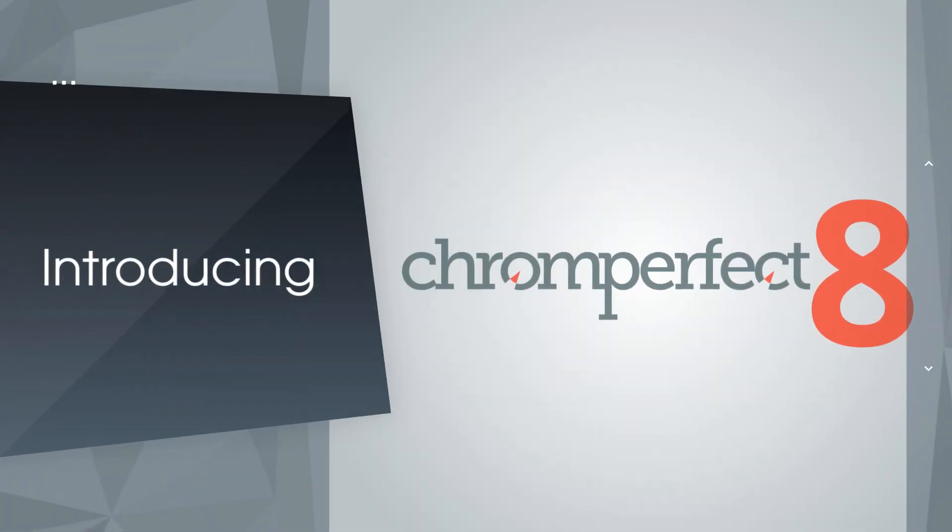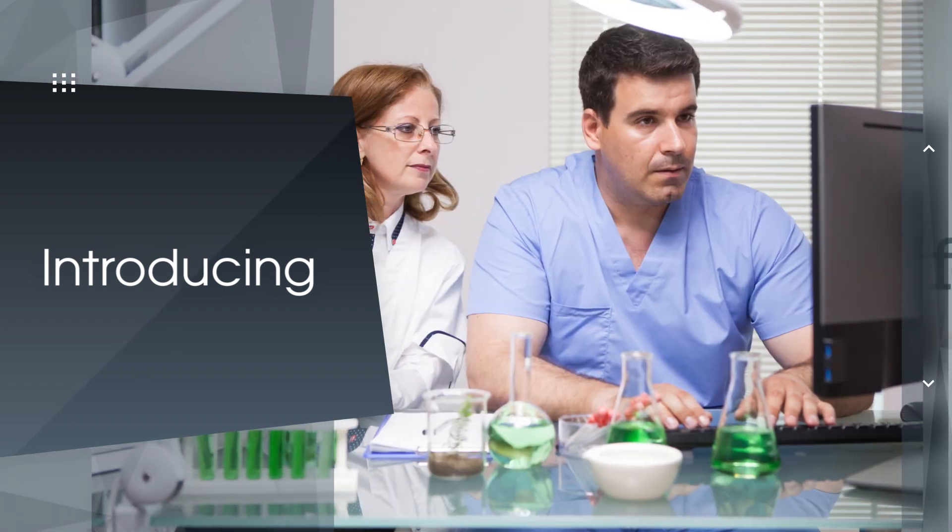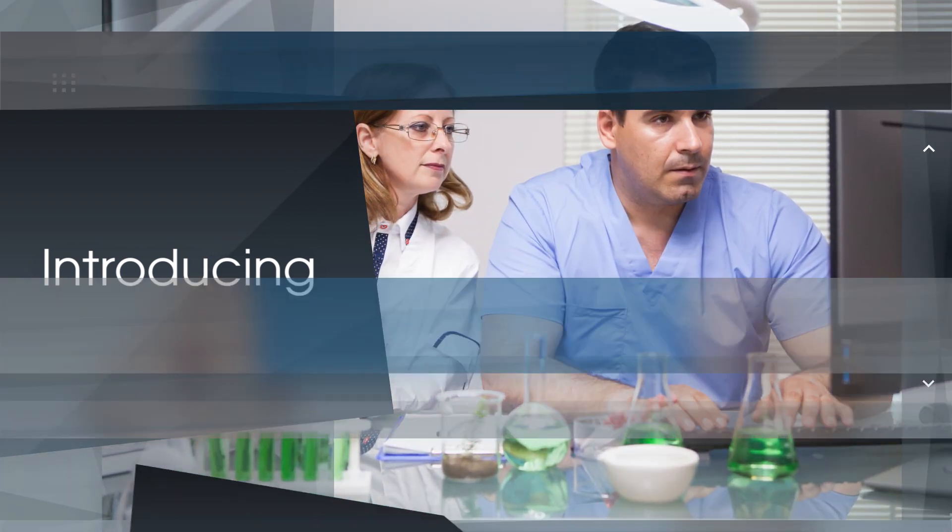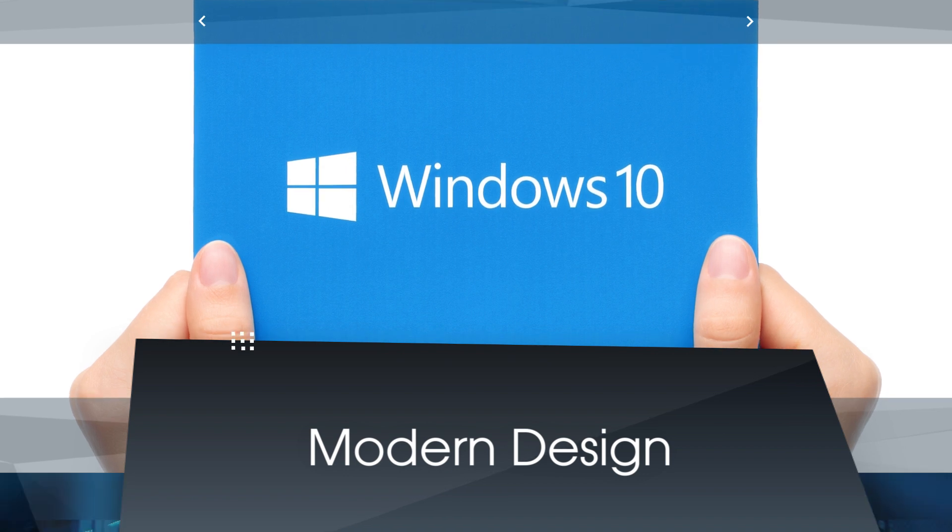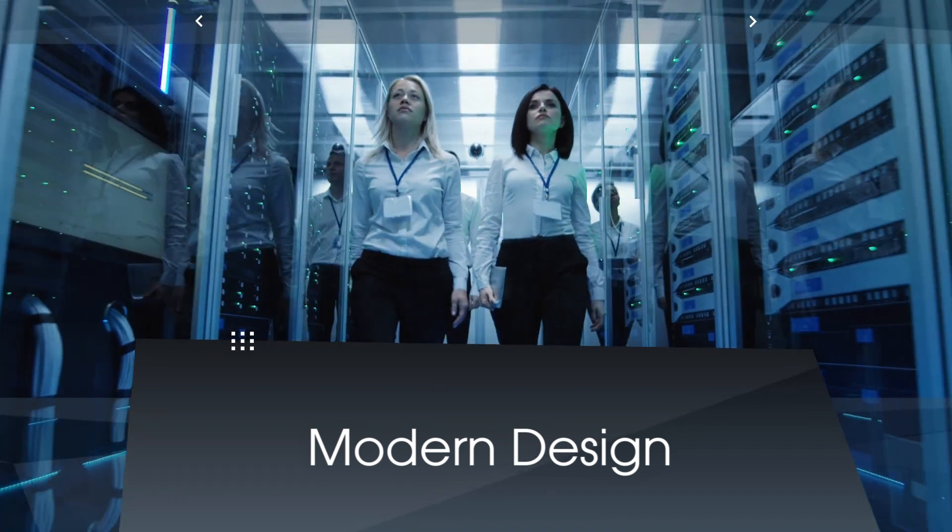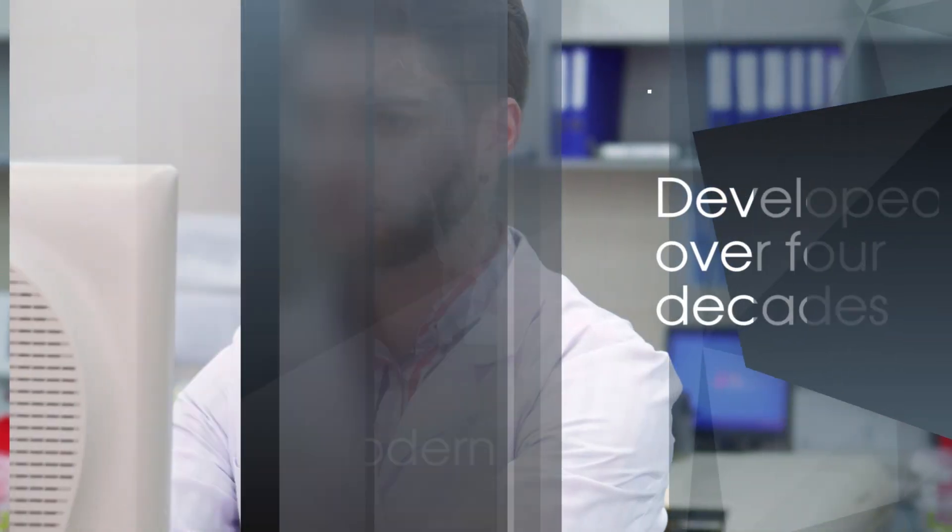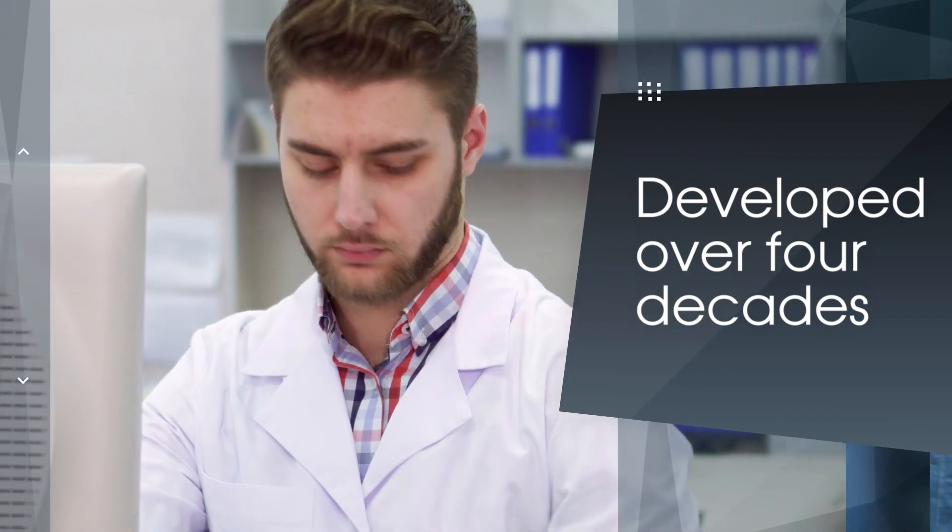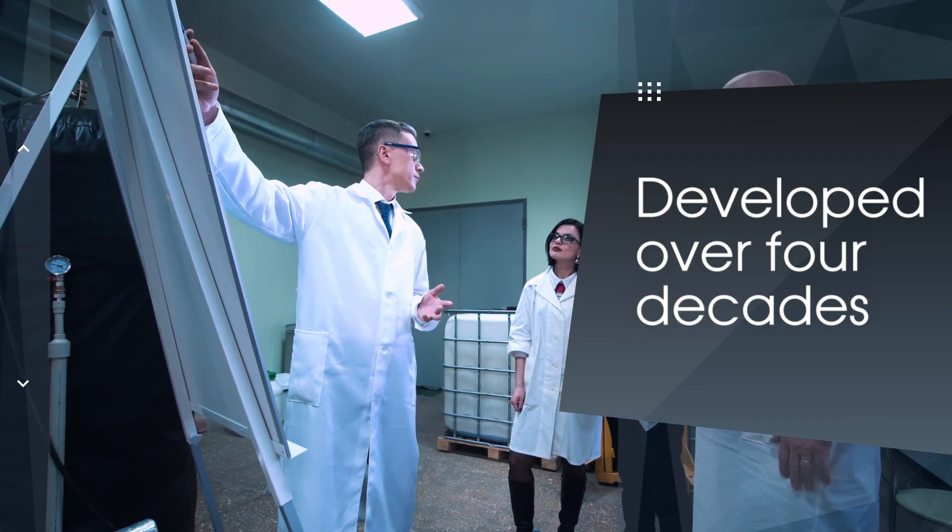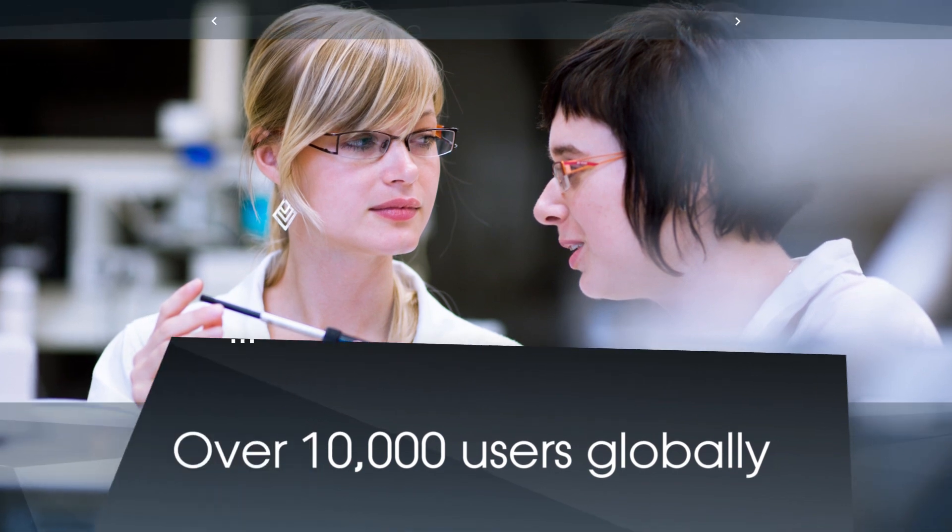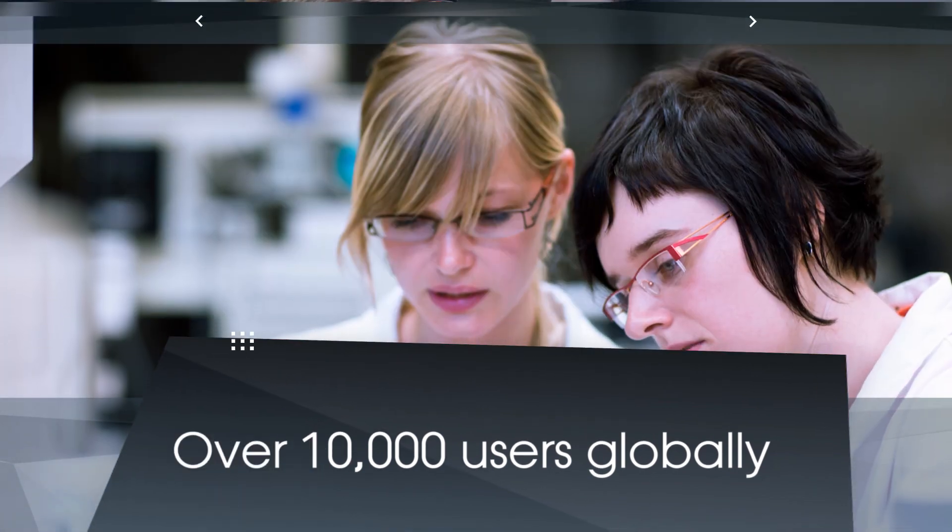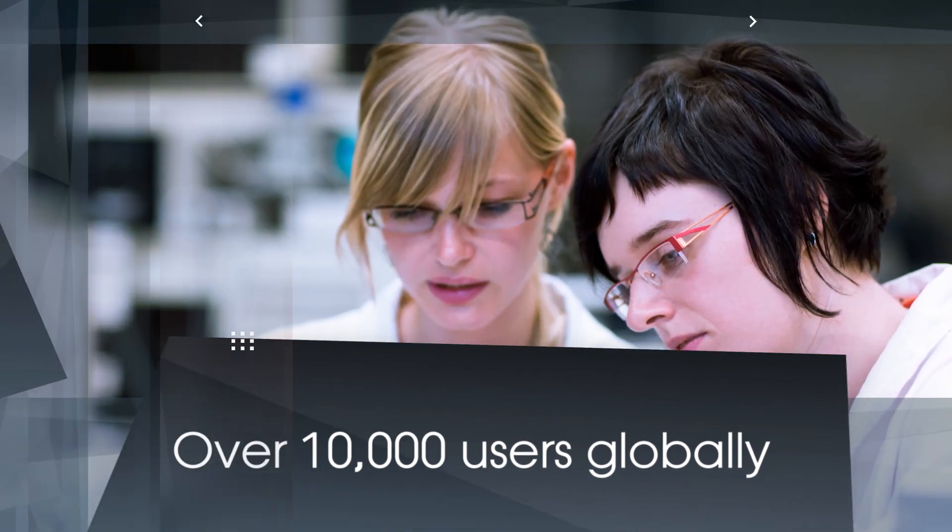Introducing ChromePerfect version 8, the leading independent chromatography data system for Windows 10. Released in the early 1980s, ChromePerfect has been the choice of chromatographers and chemists for nearly 40 years. We are going to explore why over 10,000 users depend on ChromePerfect.